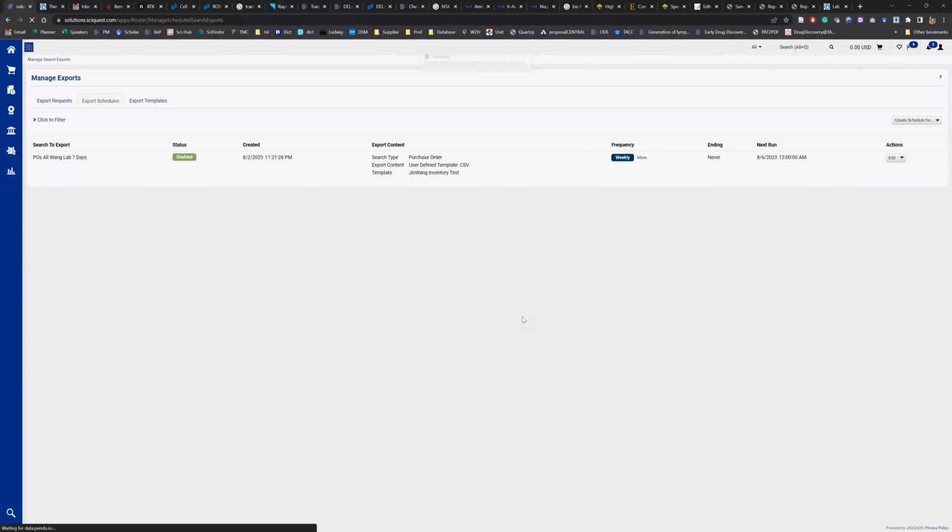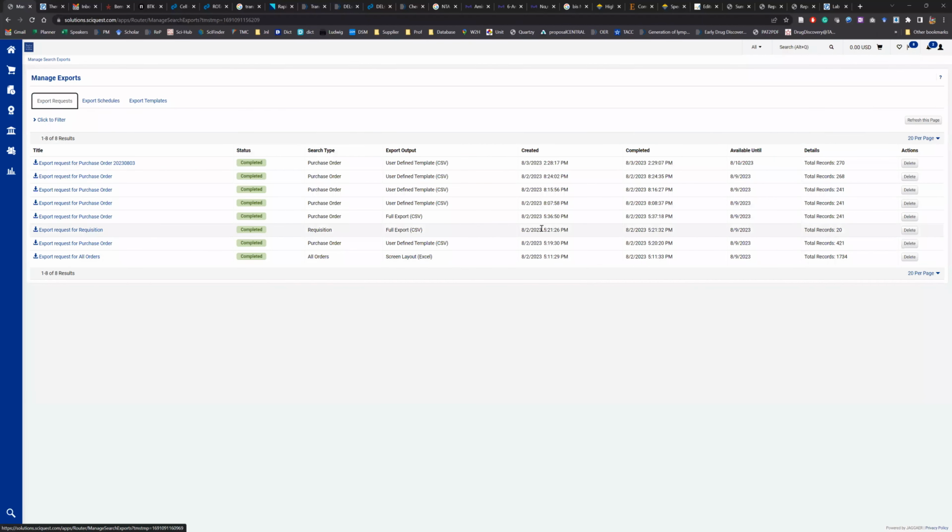So then basically every Sunday, suppose, and I haven't done that yet, but suppose the system creates an Excel file with only the new orders in the past week, then you can merge this with your master file. Update it and ask your lab members to update the location of the reagents from the past week. I hope that will be the most convenient way to track orders down the road. Thanks.